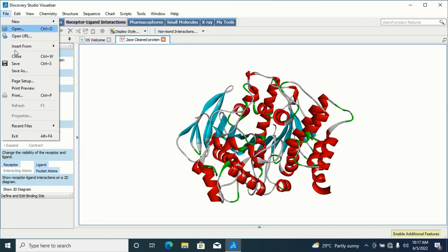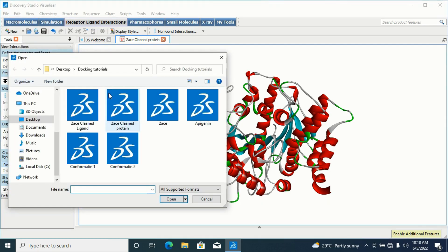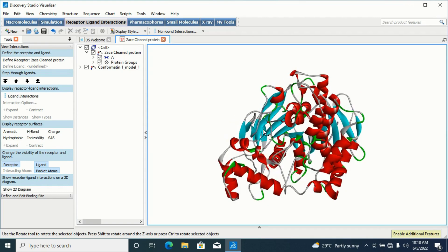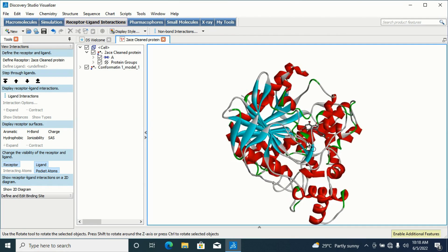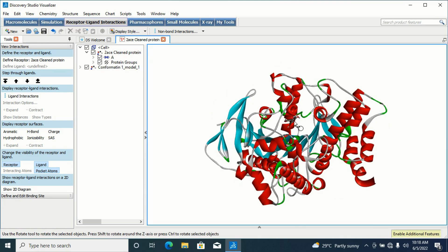To insert the first conformation, I'll go to File and this time use 'Insert From', then 'Insert From File'. I'll look for the ligand I saved as 'Conformation 1' — it's under my docking tutorial folder. I'll click on it and open it. It will insert the ligand — you can see it has been inserted inside the protein at the active site.